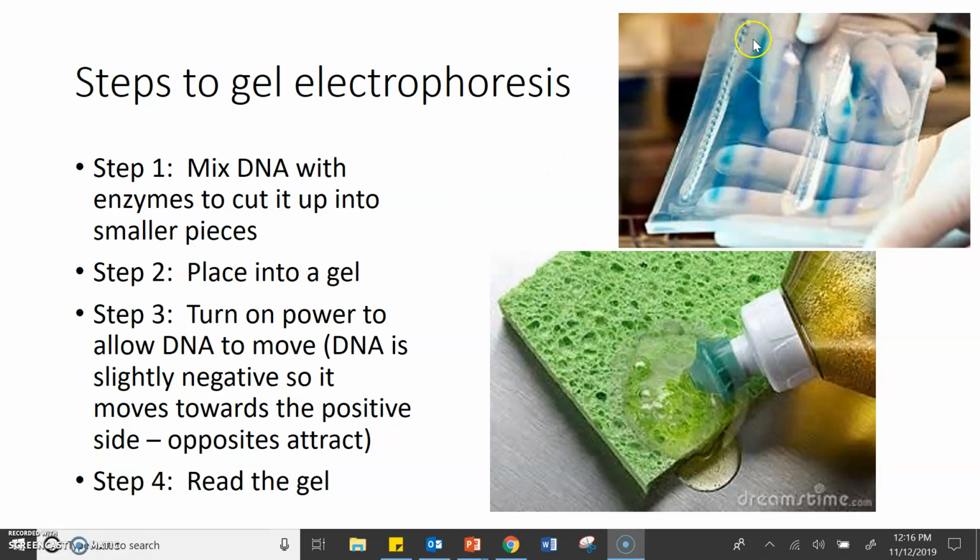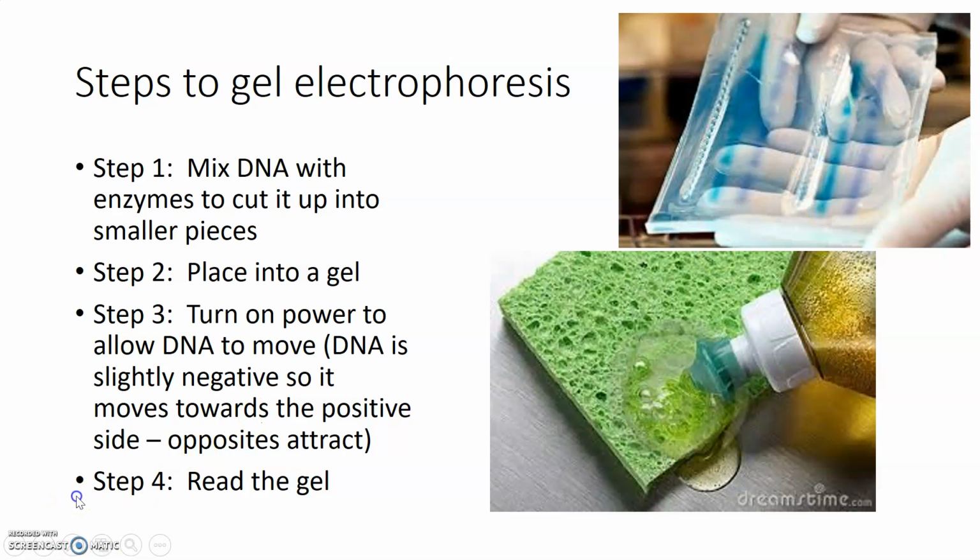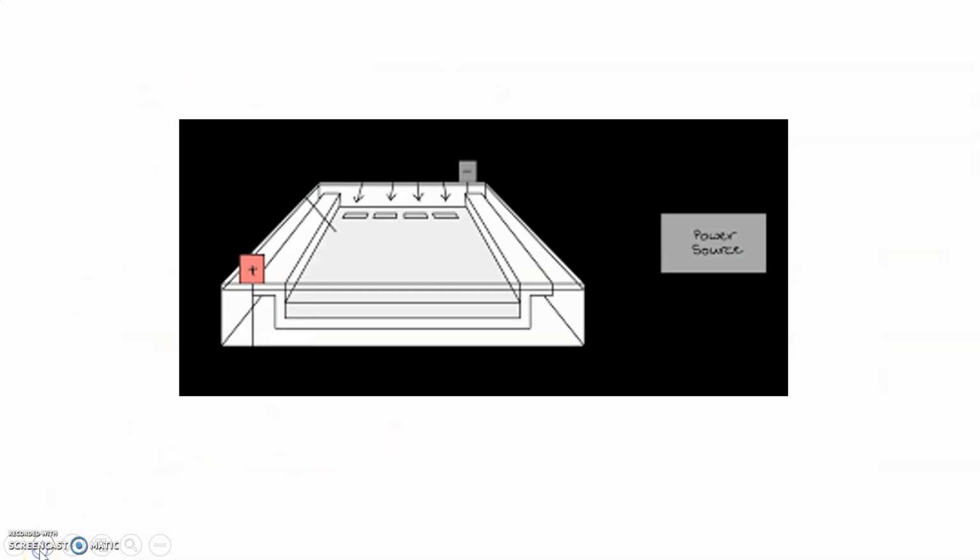And so when I read the gel, I can compare them. And these strands, if they're from the same person, the enzyme should have cut them up into the same pieces, and so all of these things should match each other. So here you can see I have this big plastic thing that I put it in.